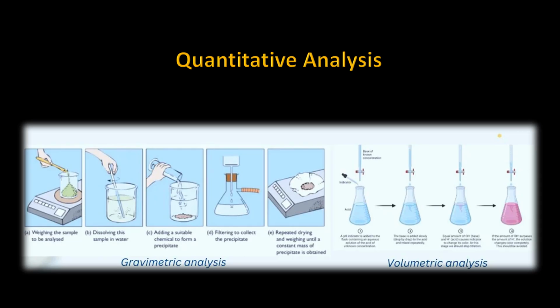Qualitative analysis is useful for the determination of interfering elements or compounds before conducting a fire assay and/or chemical quantitative analysis. Quantitative assay is useful as it can determine the concentration of silica and more. The determination of silica would be necessary for the silica component to be calculated for the flux requirement in fire assay.